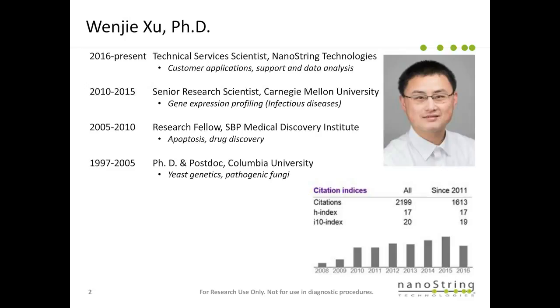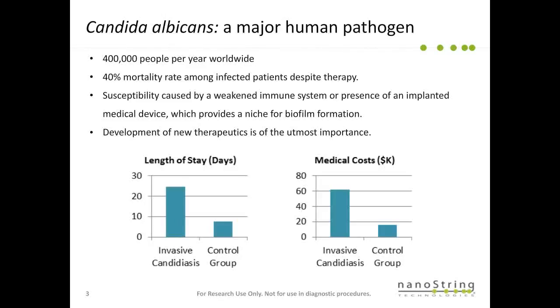Yeah, thank you, Christina, for the nice introduction. So I will start my seminar. Today I'm going to introduce how the NanoString nCounter technology, the platform, can be used to study infectious disease, in this case, Candida albicans.